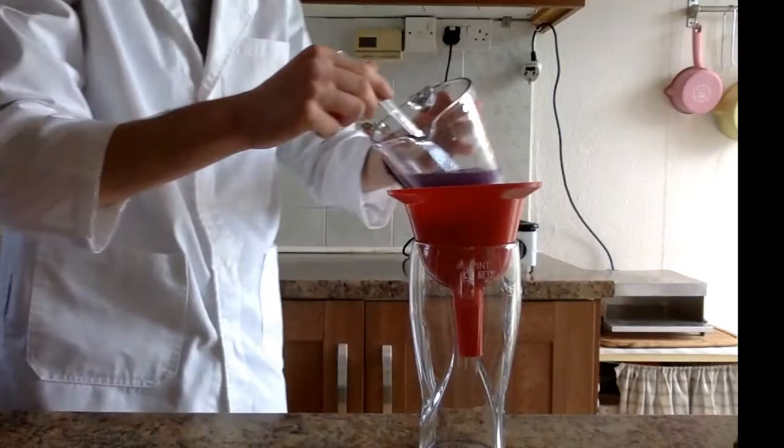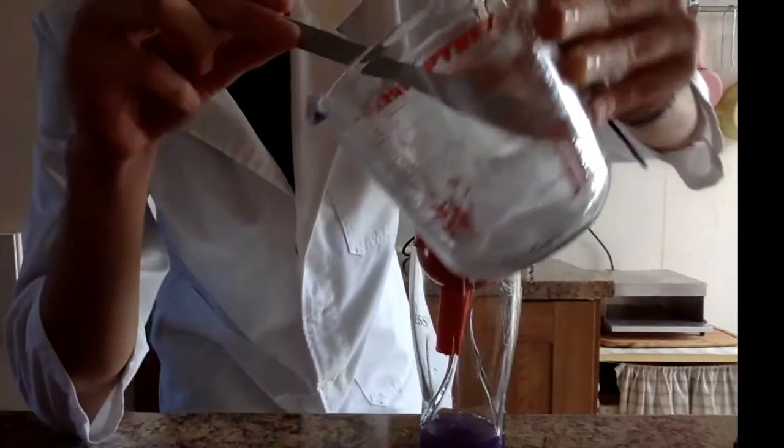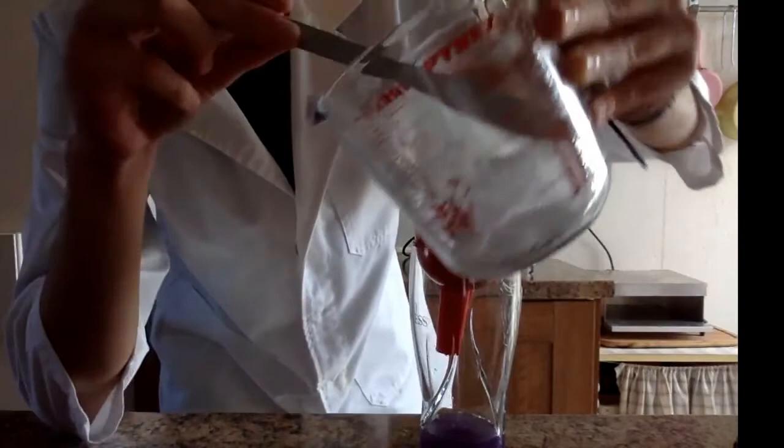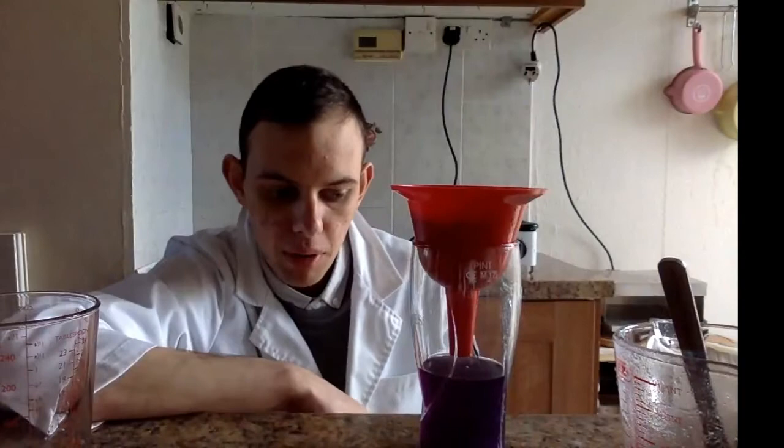I have been stirring the vanilla sugar for around five minutes, so I think it's ready to start filtering. Over here I have my funnel with my filter paper and this will be a plain gravity filtration. I am going to pour in the vanilla sugar mixture now. As you can see, there's still quite a lot of the vanilla sugar stuck in the beaker, which is why we have the extra methanol. Now that we've put all our vanilla sugar over here, we will just wait a few minutes and let it filter out.